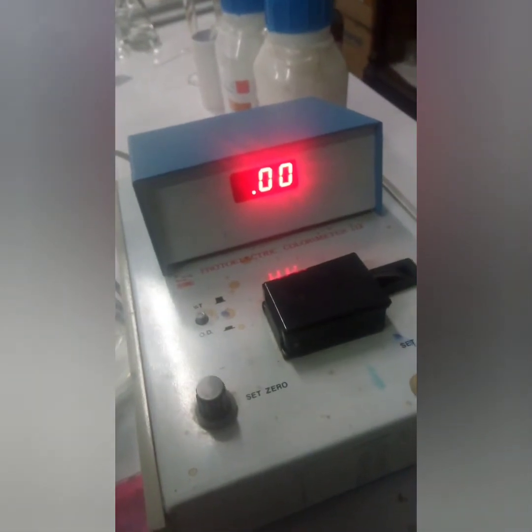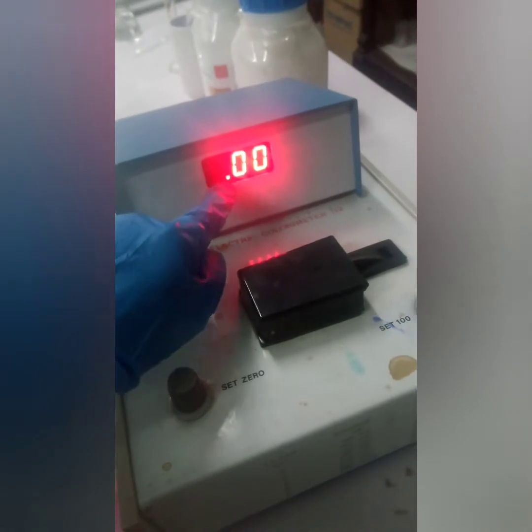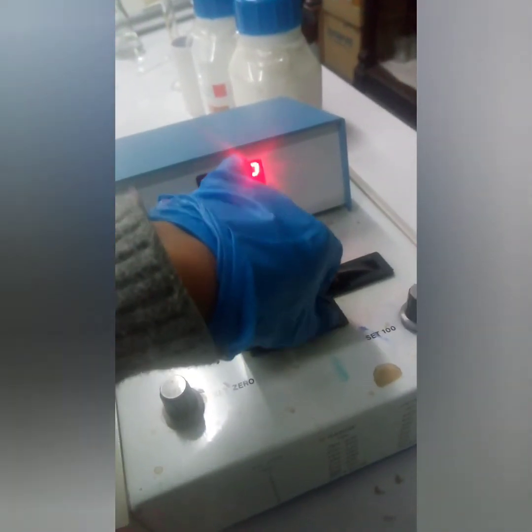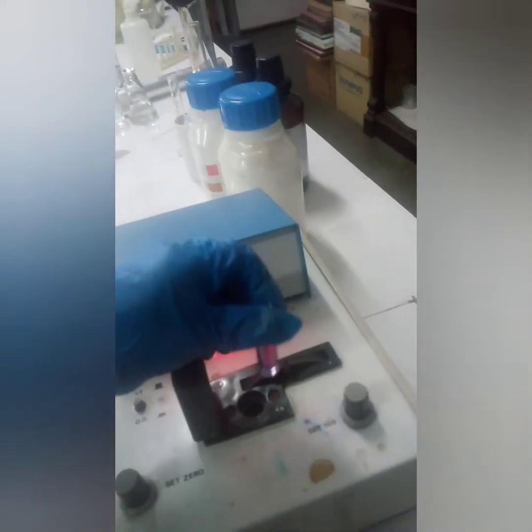After you set this to 0 using the blank sample, now I will take out the blank. Then in the same way, you will measure the absorbance reading for all these other samples using this colorimeter. Now taking the first sample, I will take the reading of the first sample.